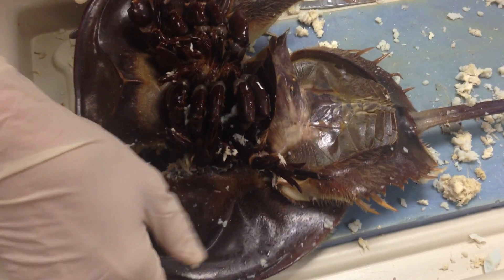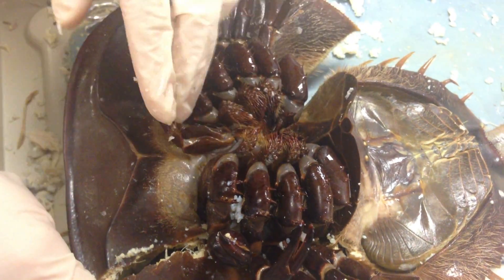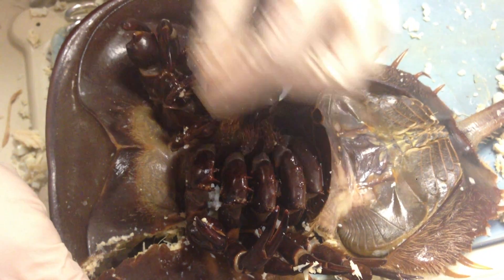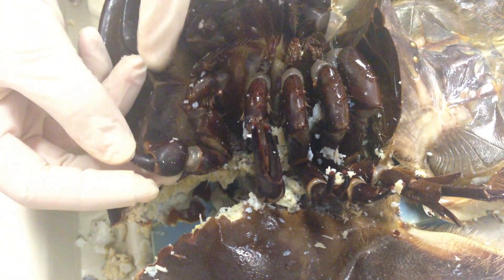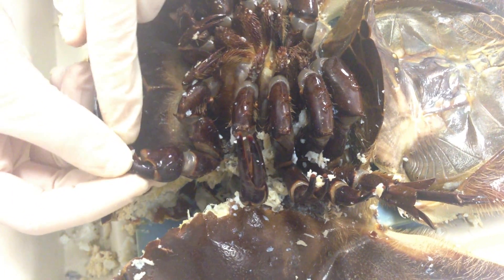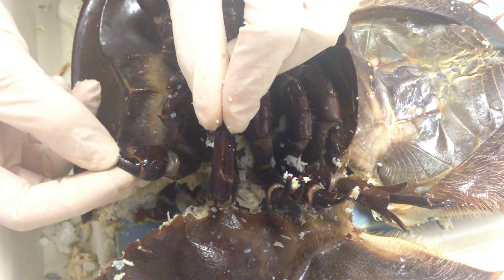If we flip this organism over we're going to see the underside. Here you have the chelicerae, which are these small structures right here. You have the gnathobase, which is going to be the jaw — 'gnatho' means jaw. These are the walking legs, and this first one, the pedipalp, determines gender. When you have a bulb structure at the end, that means it's a male. If the first pedipalp looks like this one right here, that means it's a female.